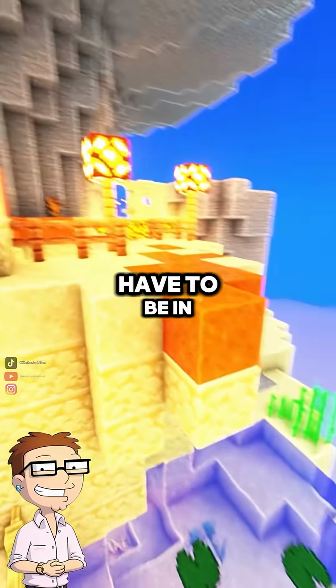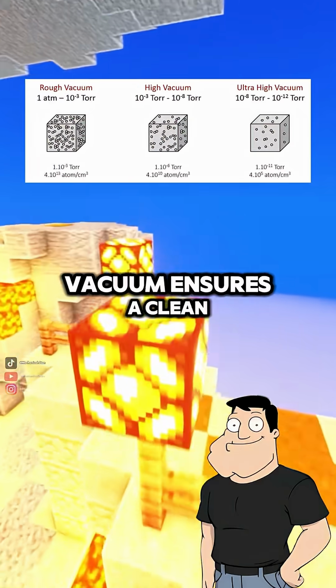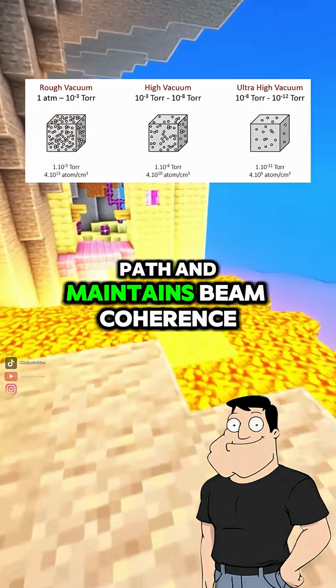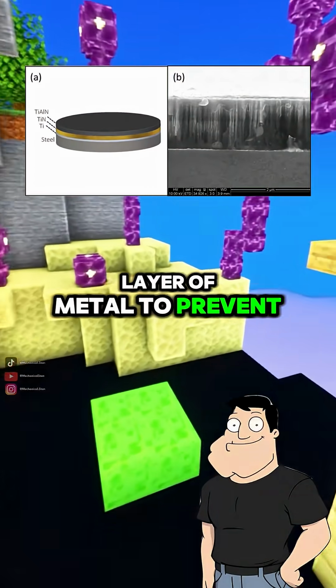Why does the sample have to be in a vacuum? Because electrons would scatter off air molecules. A vacuum ensures a clean path and maintains beam coherence. Plus, most samples are coated in a thin layer of metal to prevent charge buildup.